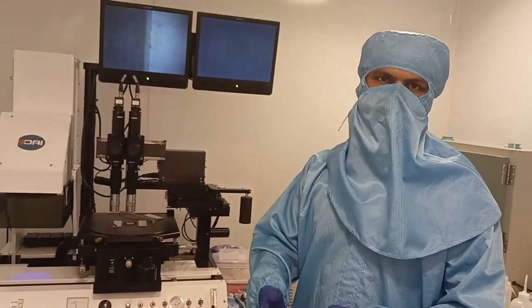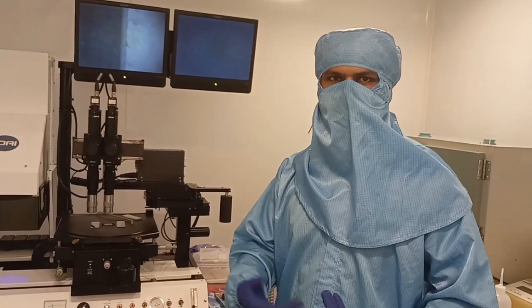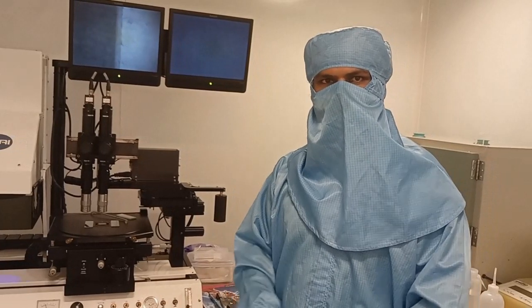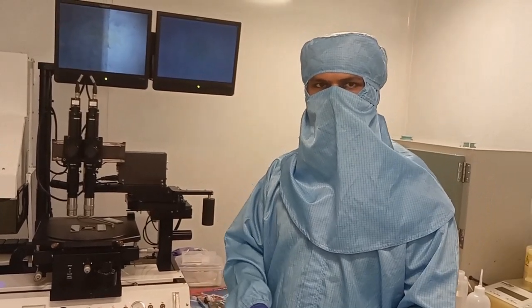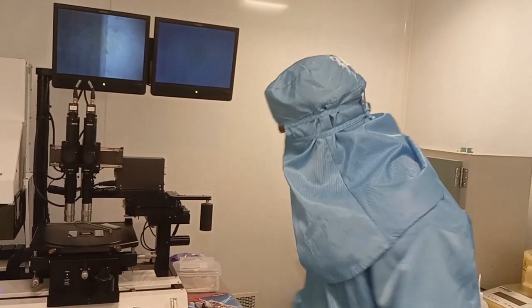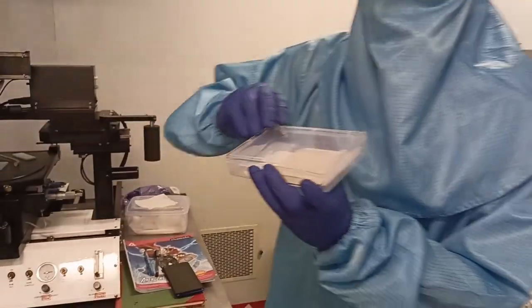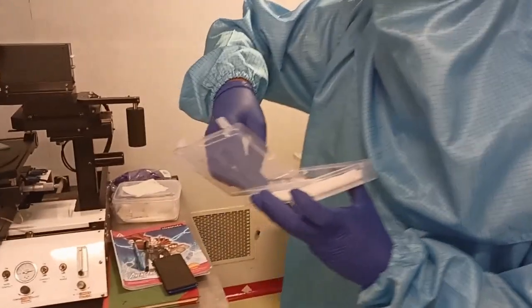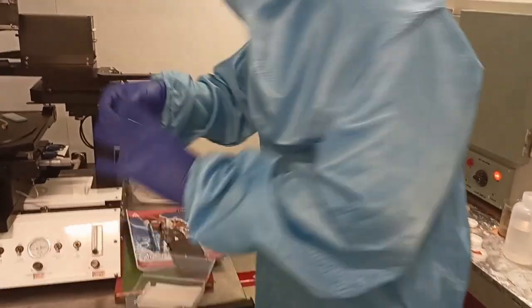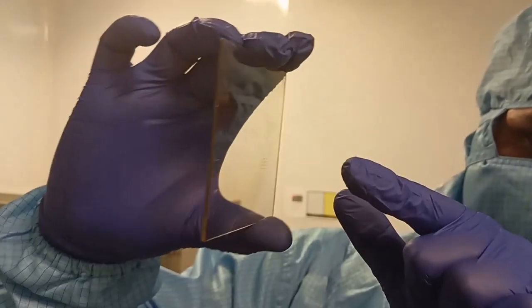The structures will be prepared previously. It is already made, and using that structure you want to expose. I am showing the photo mask and how it looks. So this is our photo mask. You can see many structures have been imprinted previously, so it is already made.